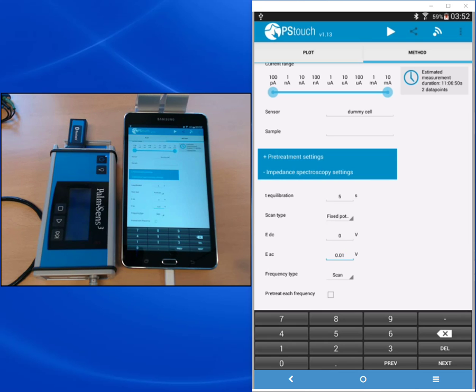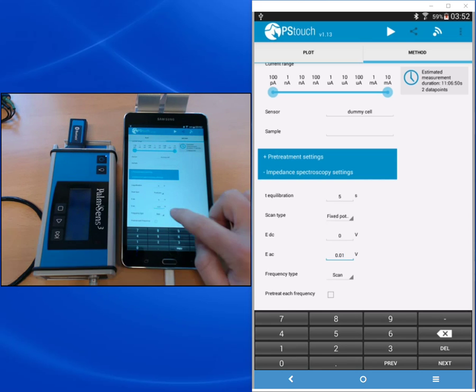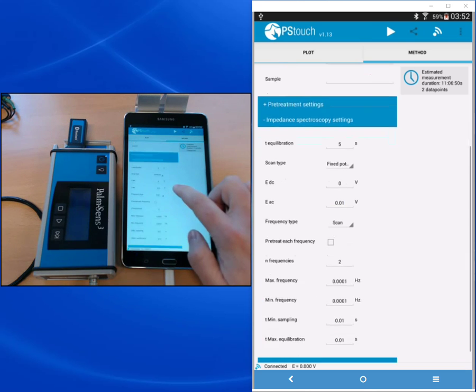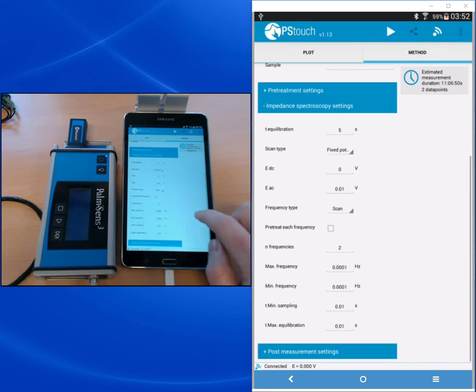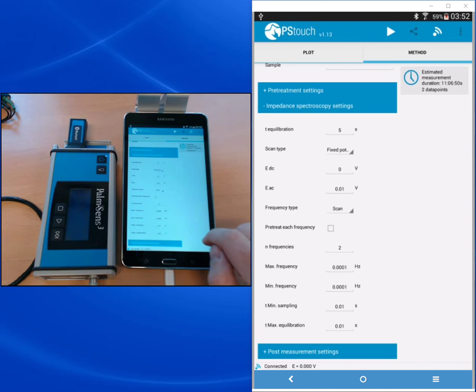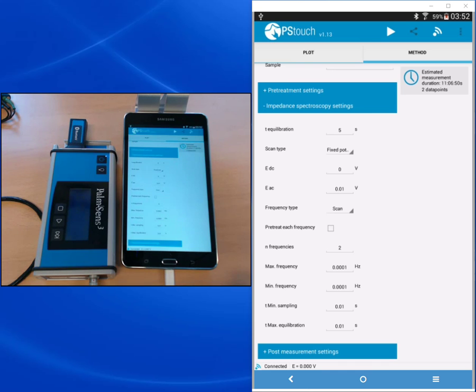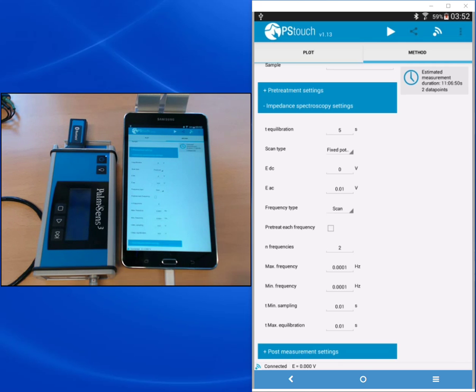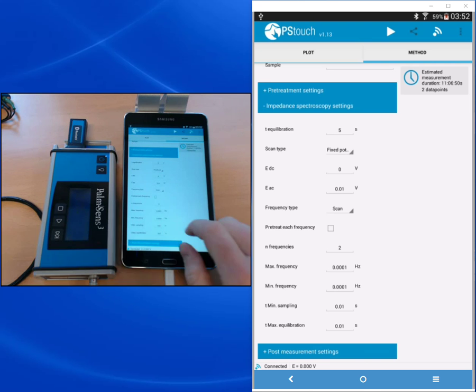You can choose to pre-treat each frequency. If you want to pre-treat each frequency, it means that before each point a pre-treatment step will be done. This can be necessary if your system is very unstable, but usually your system is stable during an impedance measurement because the currents are an AC current.